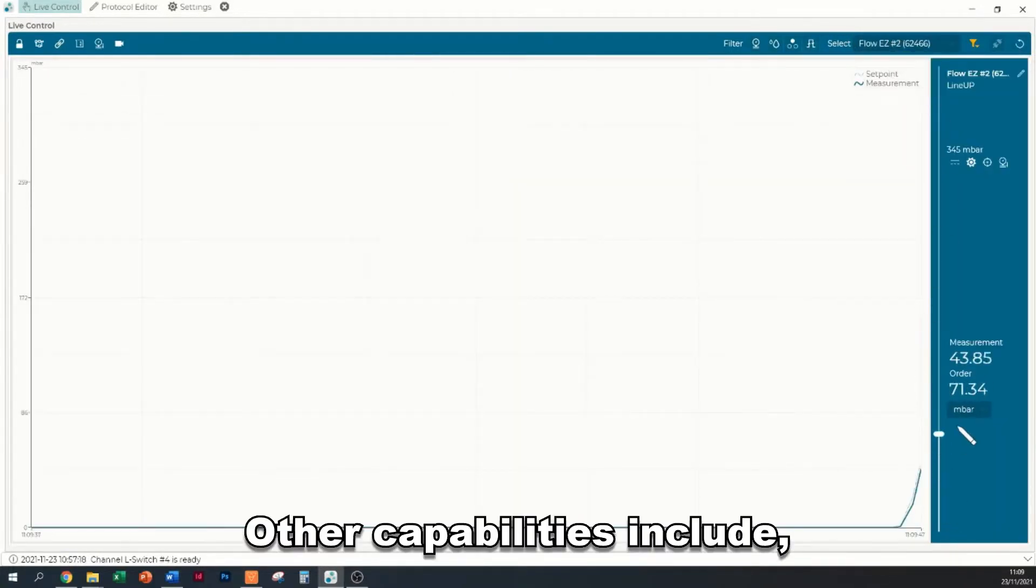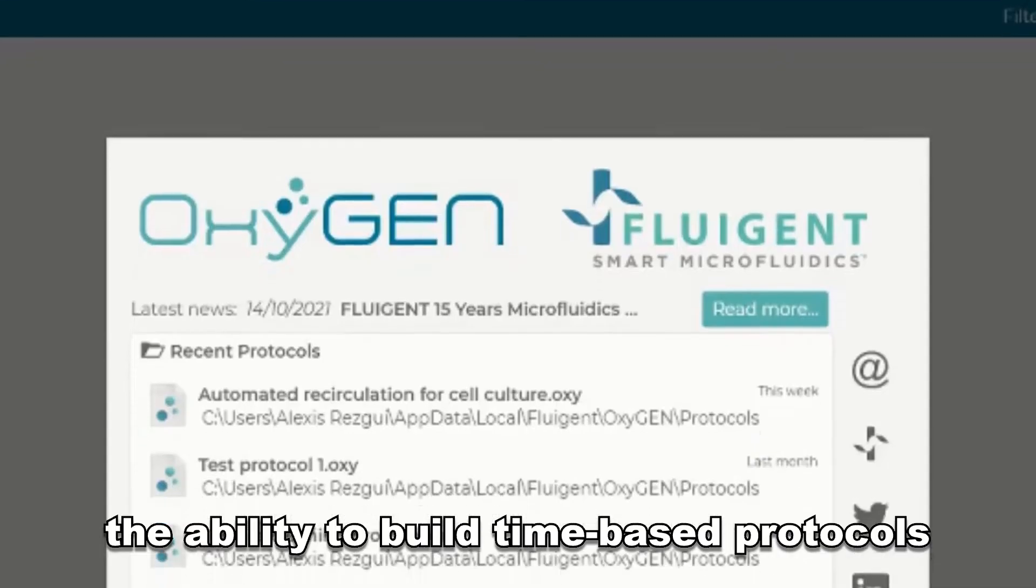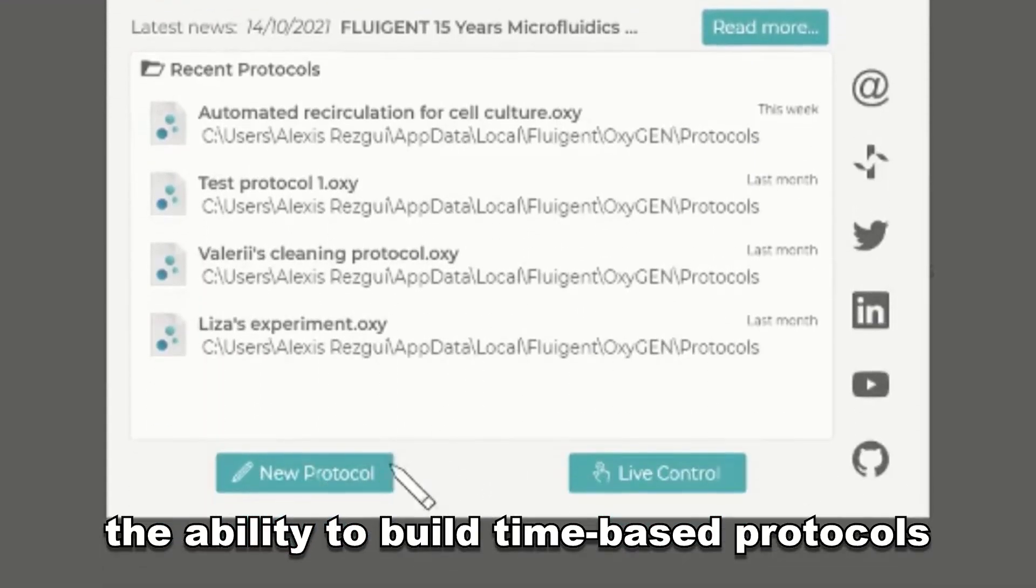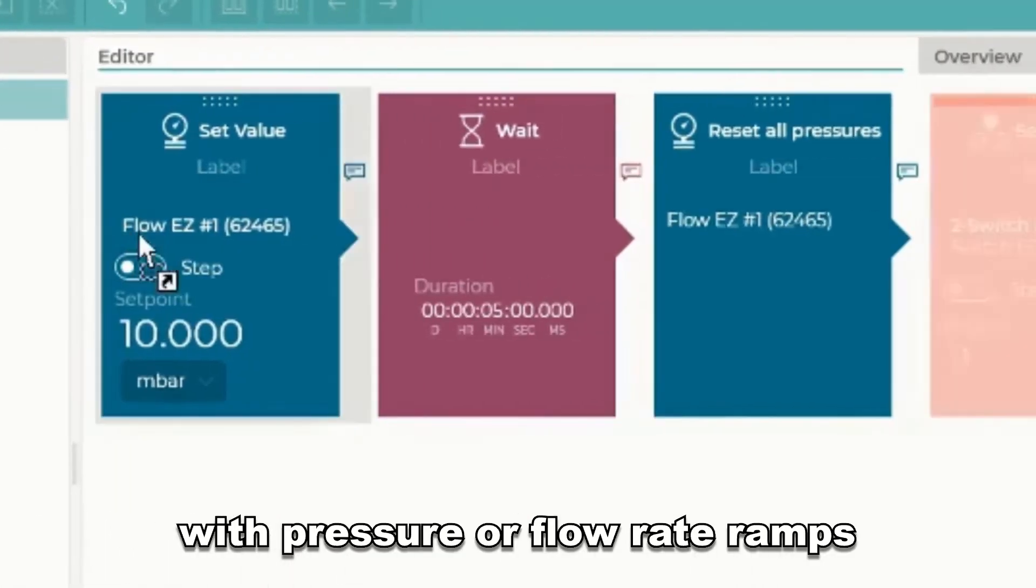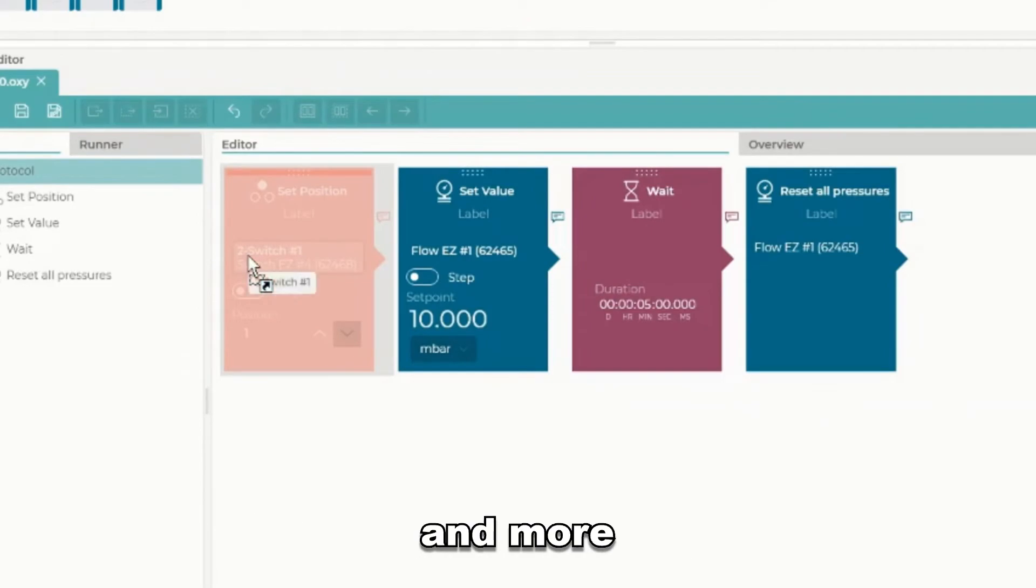Other capabilities include the ability to build time-based protocols with pressure or flow-rate ramps and more.